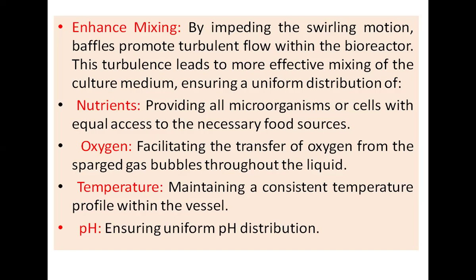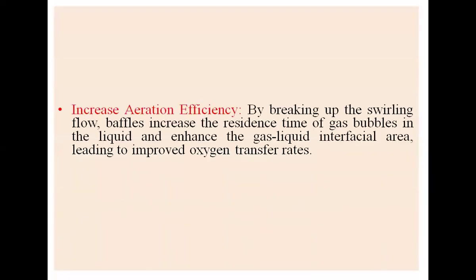Then oxygen: the baffles facilitate the transfer of oxygen from the sparged gas bubbles throughout the liquid. Baffles are also responsible for maintaining a consistent temperature profile within the vessel from top to bottom, and from bottom to top. This also ensures uniform pH distribution. So in general, we can say these baffles enhance mixing of nutrients, oxygen, temperature, and pH.